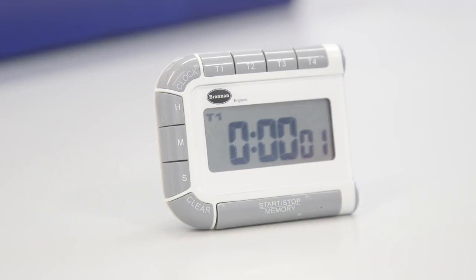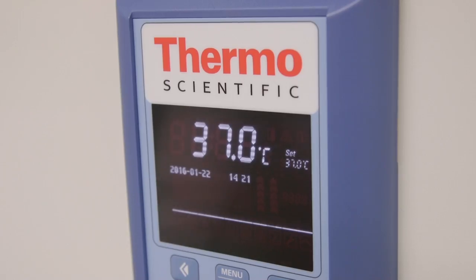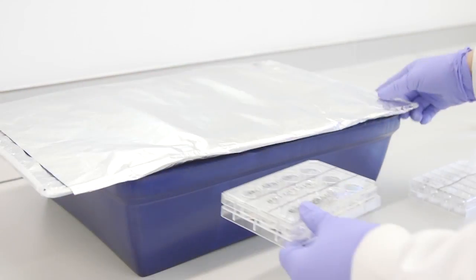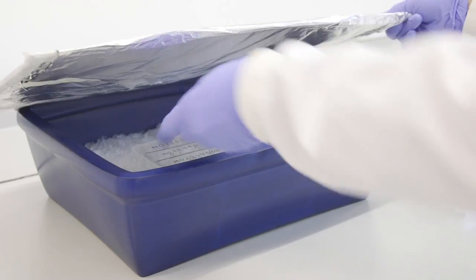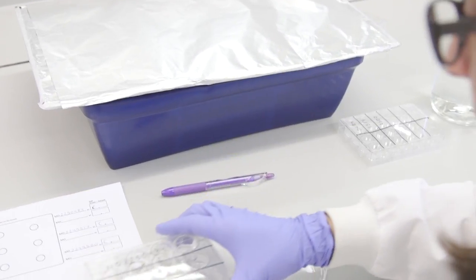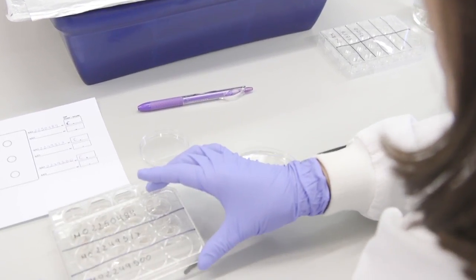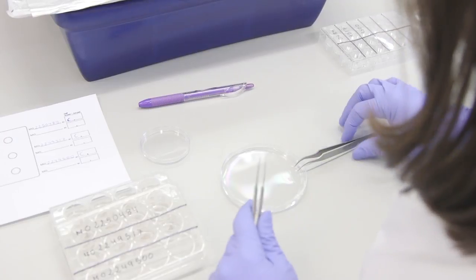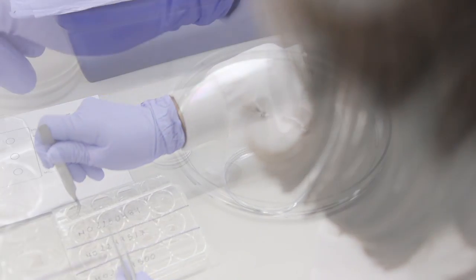When the timer sounds for the plate, remove it from the incubator and place it on ice to stop the chemical reaction. It is also important at this stage to protect the plate from light. Transfer the four ear halves from the first sample into a petri dish containing PBS at pH 7.4 so that they are floating on the surface.